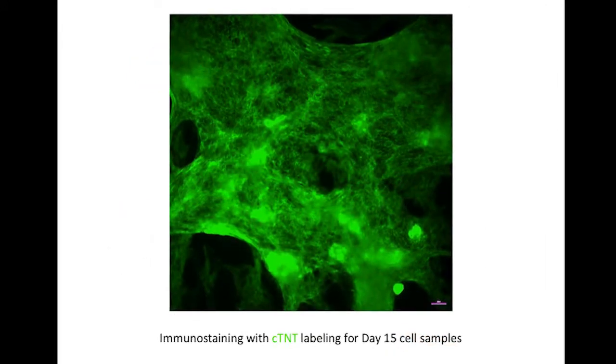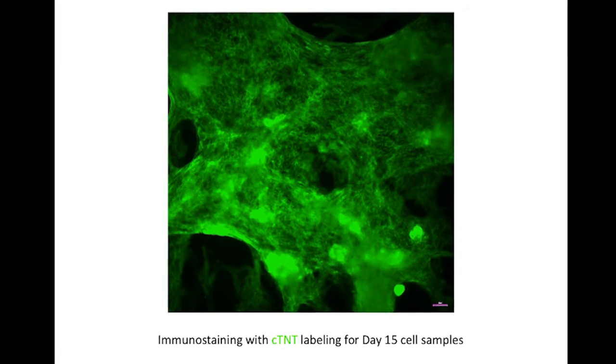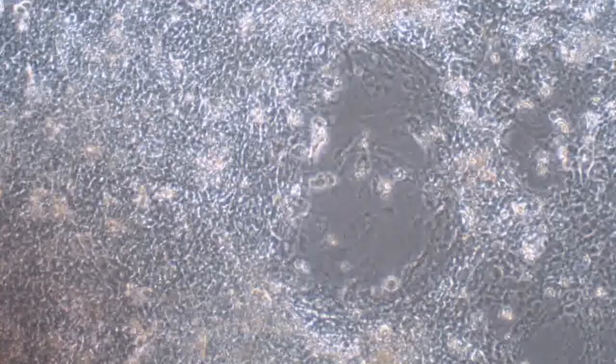Immunostaining with cardiac-specific antibody troponin T shows relatively pure cardiomyocytes generated using our protocols. This is an example showing the camera moving around a representative well, documenting the relatively pure population of beating cells.